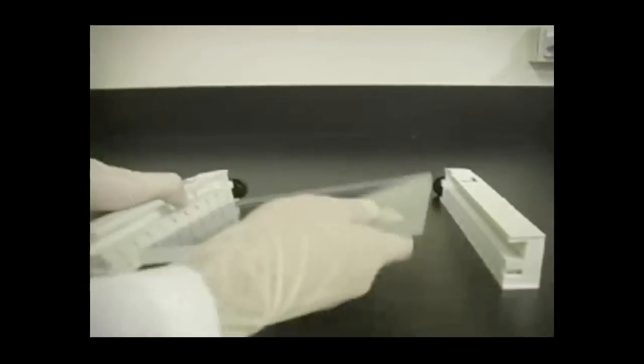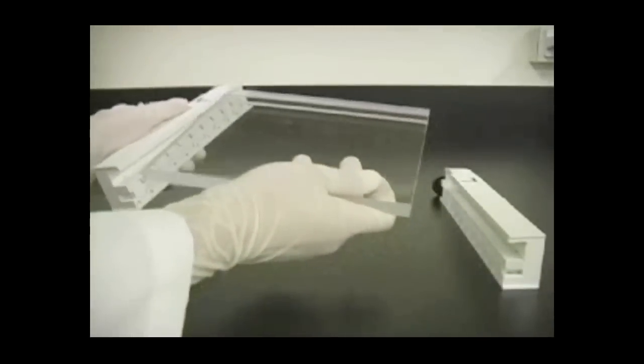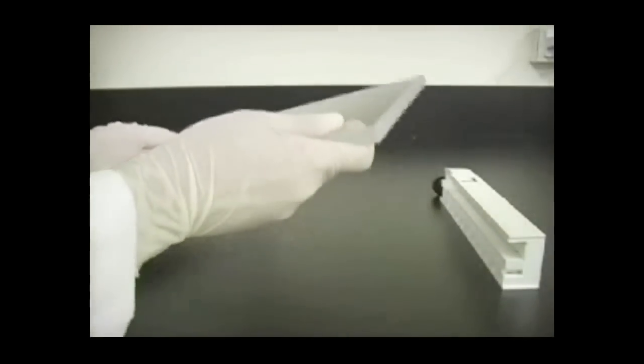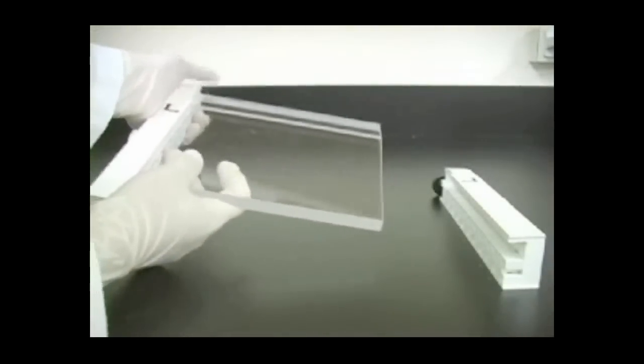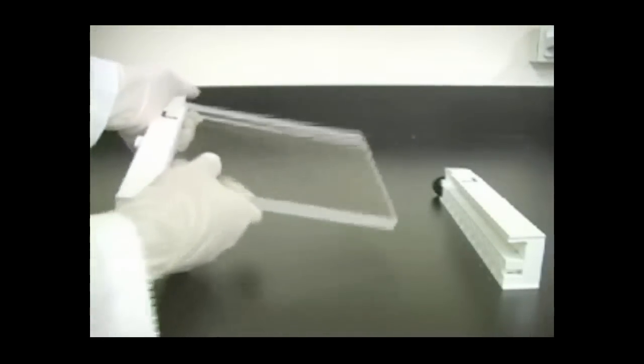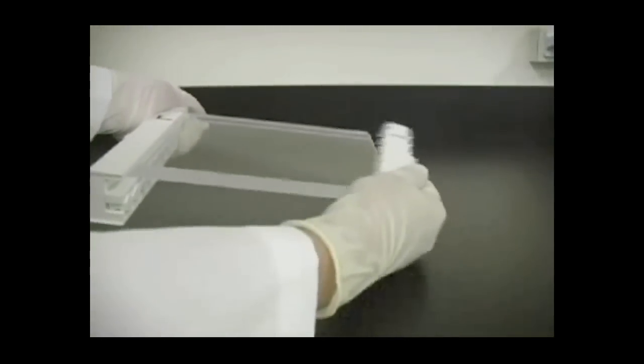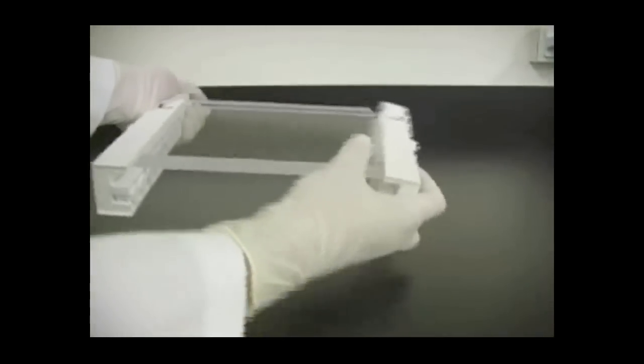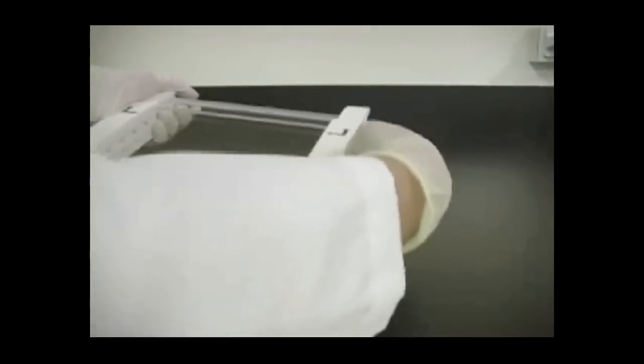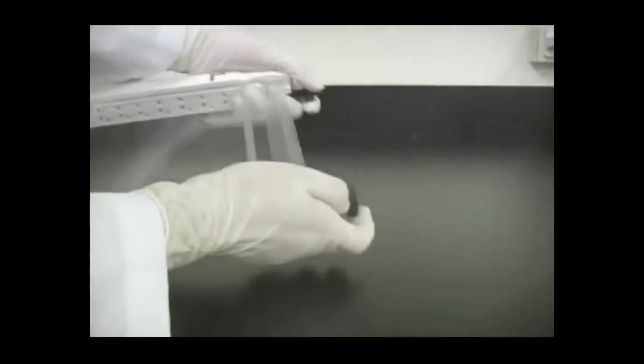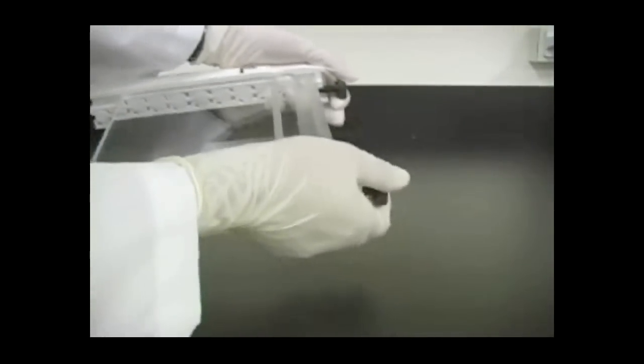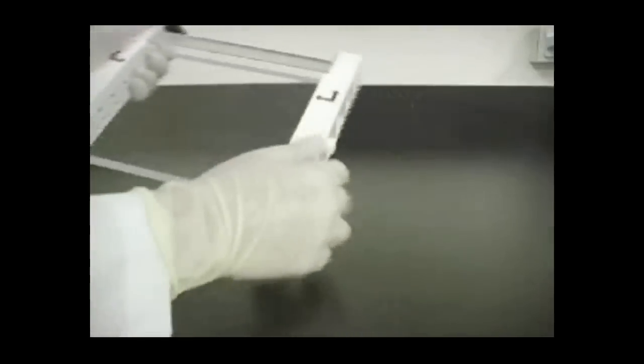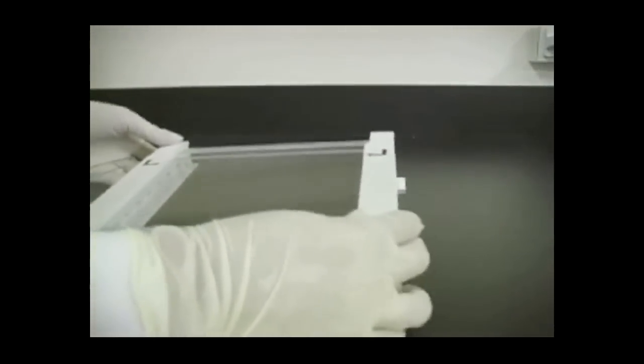If running only one gel, attach the acrylic buffer dam to the unused side of the cooling core. Position the acrylic plate between two clamps, either XI or XL will work, by matching the notches on the clamps to the notches on the acrylic plate, as would be done with a gel sandwich, and slide the dam up each clamp as far as possible. Failure to slide the dam up completely to the top of the clamp will result in an upper buffer leak. No further alignment is necessary.